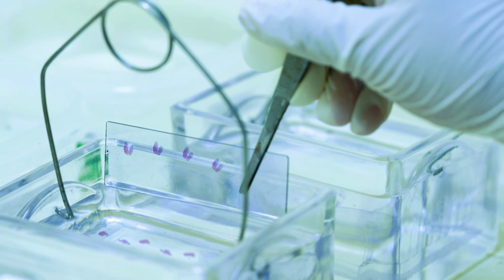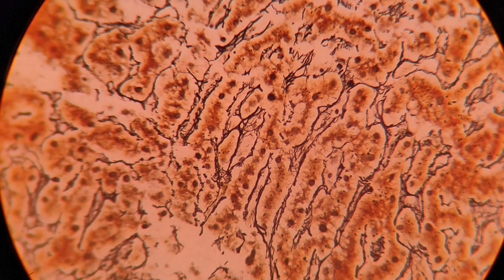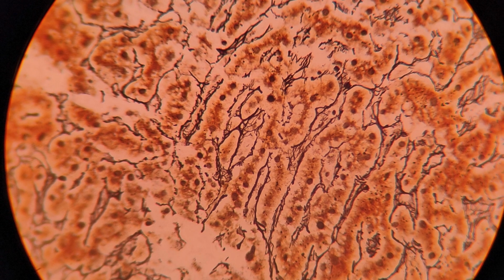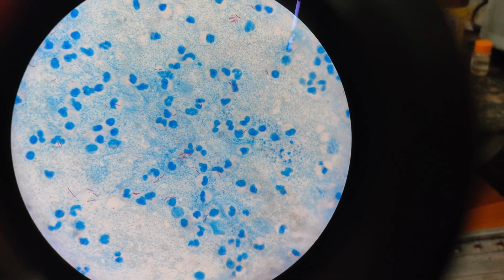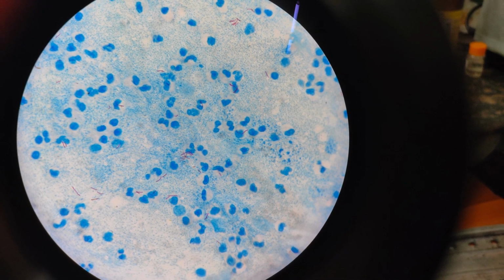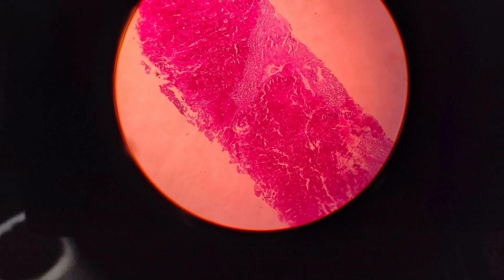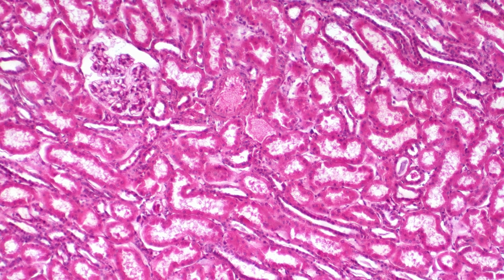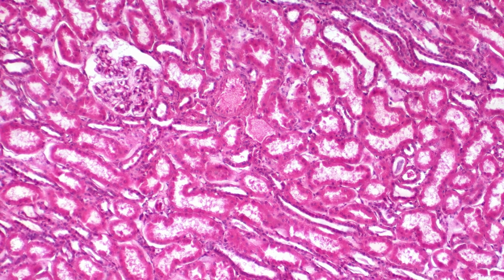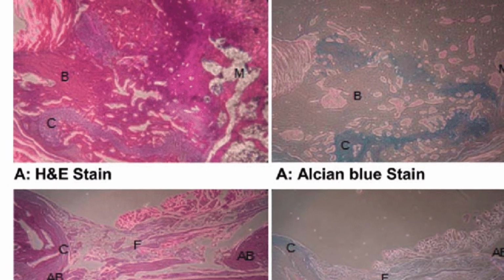1. Overview of histological staining. Sections of tissues are stained in order to give them the color needed for the structures to appear when viewed in the microscope. Biological tissues are stained because most of them are transparent. The contrast of staining between the tissues is useful in pointing out the differences between certain types of cells, tissue structure, and other subcellular components such as cytoplasm, extracellular matrix, and nuclei.